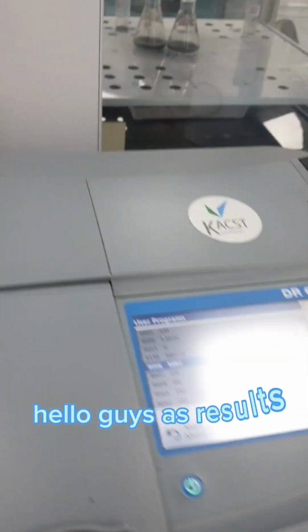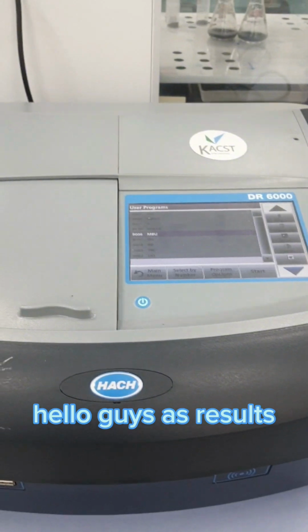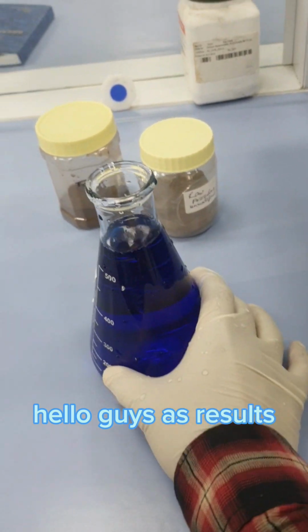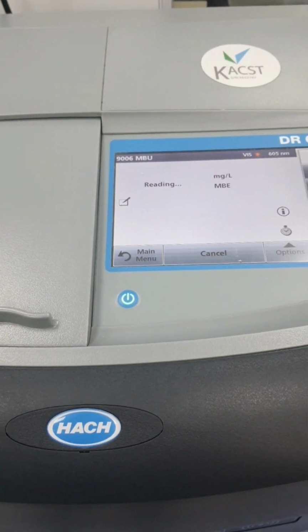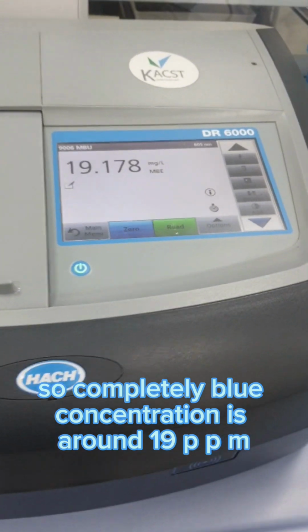Hello guys, as we saw earlier, a brief discussion about the regeneration. In today's video, we will be doing regeneration using two different kinds of adsorbent. First of all, this is our methylene blue solution. We don't know the concentration of this, so we'll first find out the concentration of methylene blue. So the methylene blue concentration is around 19 ppm.